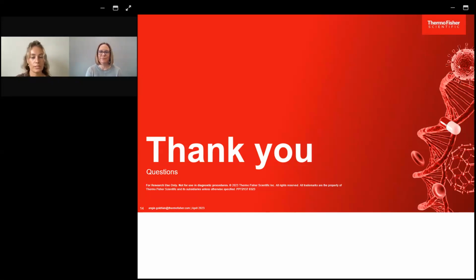Awesome. And Angie, what steps do you recommend to get clumpy cell types into a suspension that won't clog? That's always a fun question, right? I always recommend filtering samples before you run them. That's always a critical thing. Get rid of any clumps in advance before they go through the sample line and the nozzle tip.